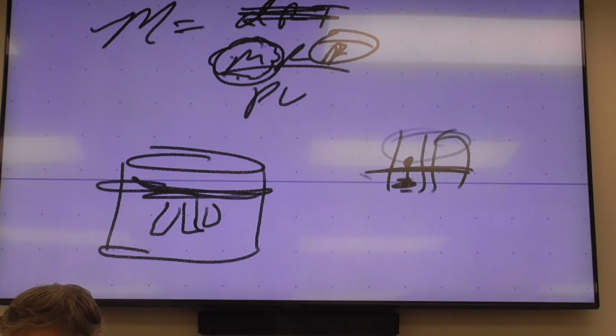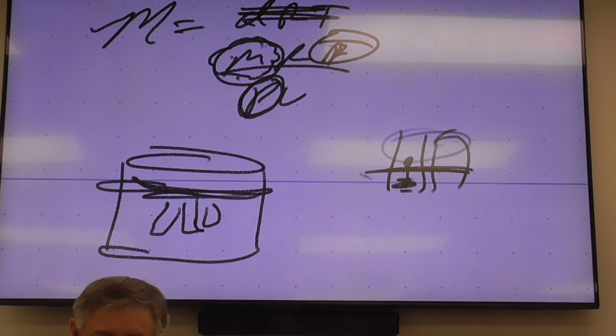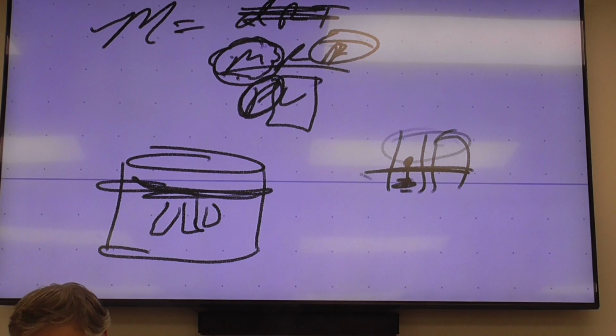That's the warm water, okay? Now, the pressure, I'll get you the pressure. I got to check. The pressure's kind of been all over the place today because of the weather, so I'll get you the pressure. Now, the tricky part comes with the volume, okay?